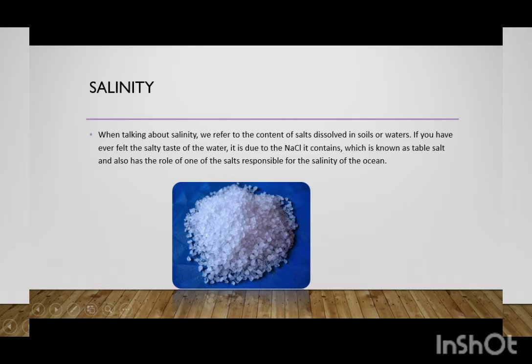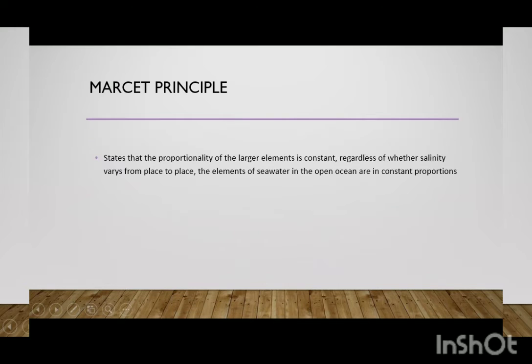When talking about salinity, we refer to the content of salt dissolved in soils or waters. If you have ever felt the salty taste of the water, it is due to the sodium chloride it contains, which is known as table salt and is also one of the salts responsible for the salinity of the ocean. In the experiment, we will use the water dissolution property to measure the amount of salt from any water sample collected from a water body, or failing that, some simple prepared at home.